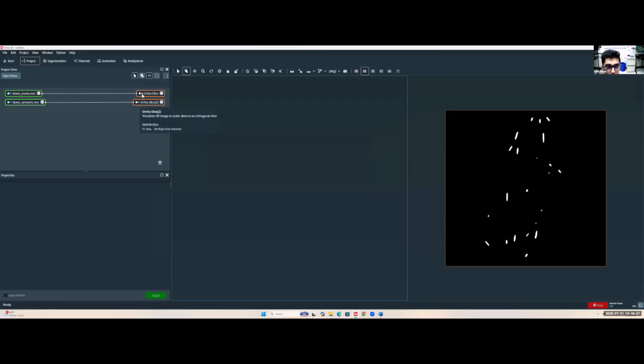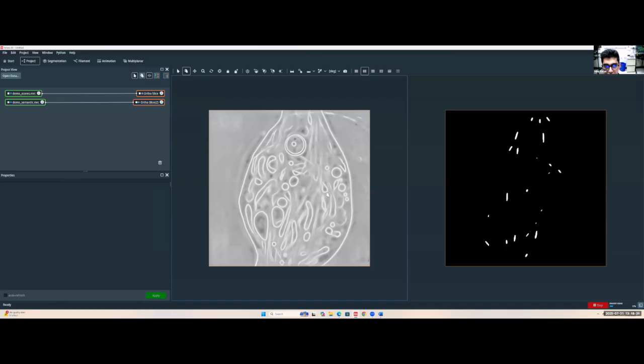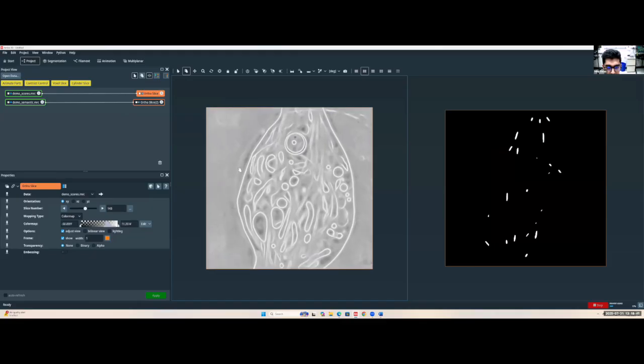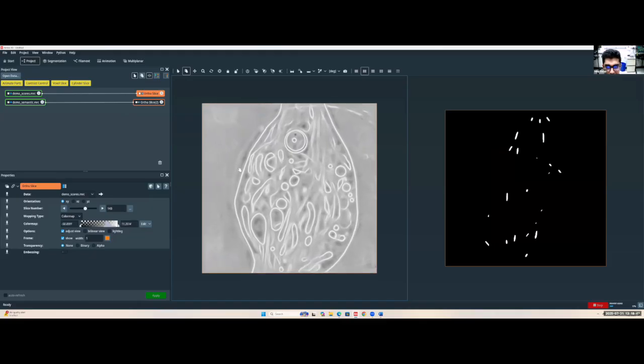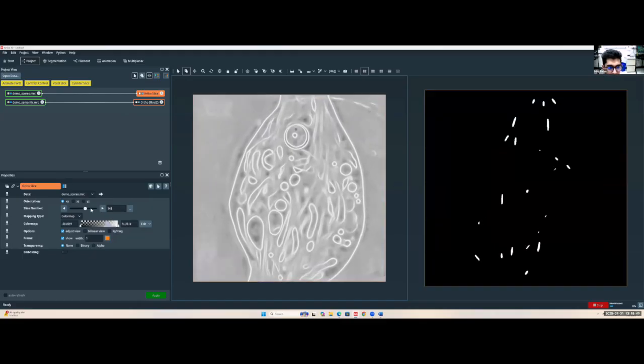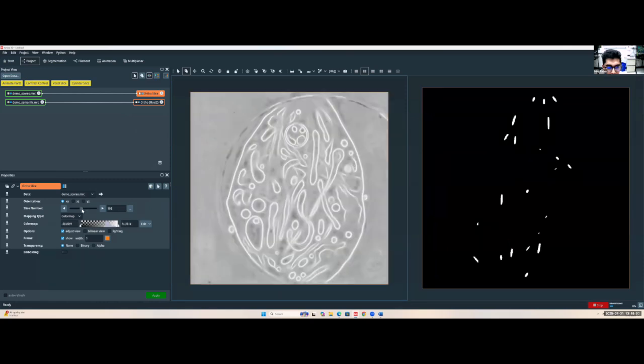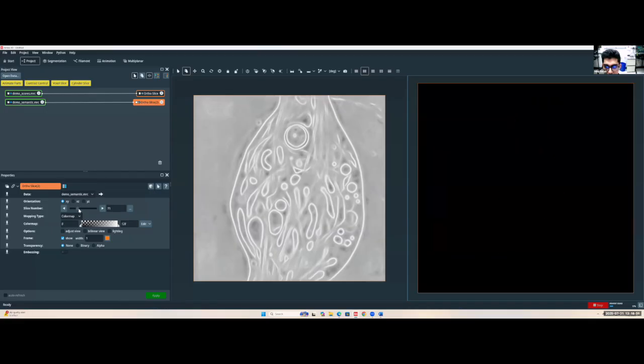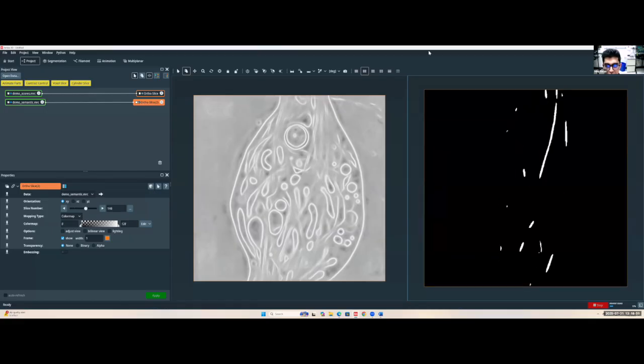And if I want to show the scores on the left side, I can select that. Now I can see them both at the same time. You can select one to scroll through the Z, you can use the slice number, or you can actually use the mouse wheel. So I'm using my, not the mouse wheel, I guess. Mouse wheel zooms in and out. But you can use this to scroll through the Z slices of that. And there we go. So this is how we're going to import and set ourselves up for segmentation in Amira.